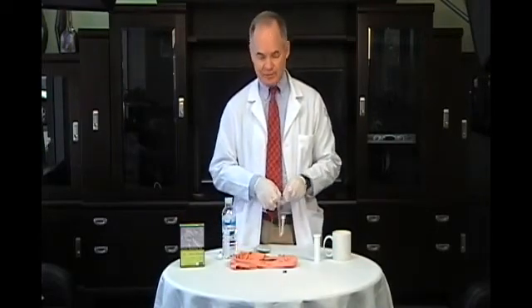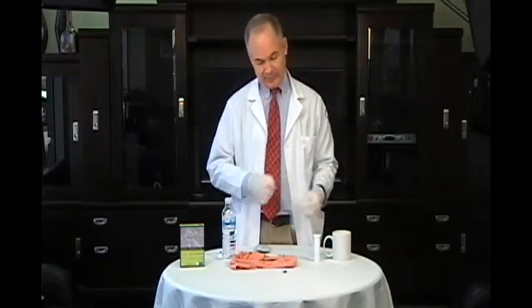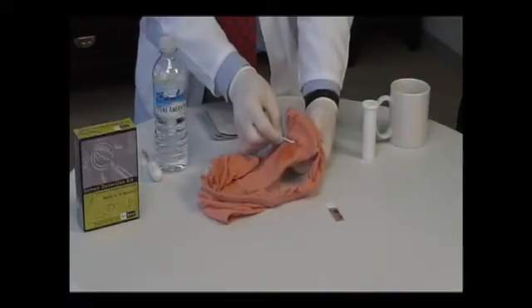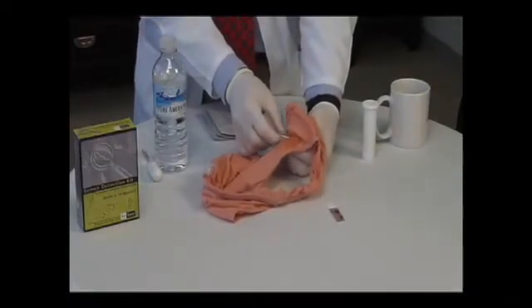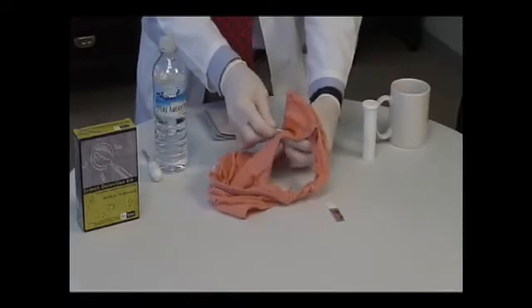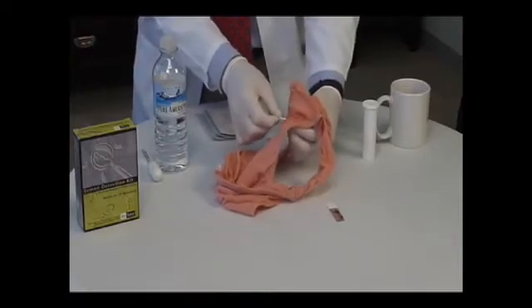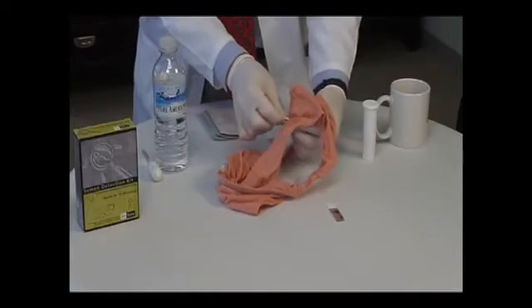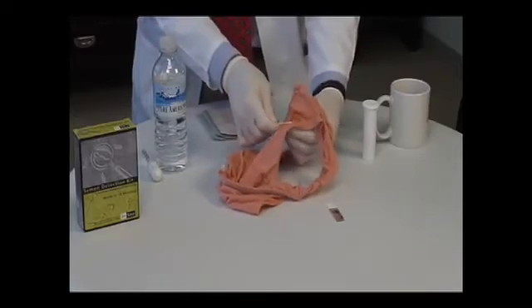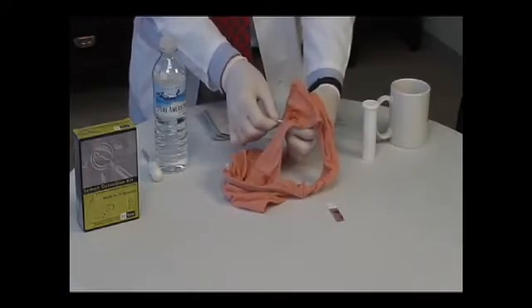The second technique I'm going to describe uses a Q-tip to transfer material from the garment to the Q-tip, like this. You wrap the underwear around the Q-tip, transferring as much material as you can to the Q-tip. We're going to press the crotch around the Q-tip, trying to absorb as much as we possibly can. Now, this technique is going to avoid leaving any dyestuff on the underwear so that whoever wears the underwear won't become suspicious that you've been testing it.